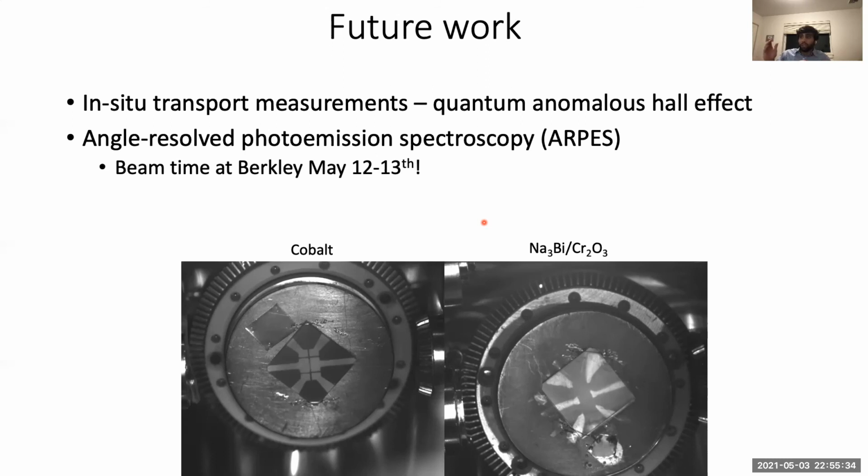And so as you can see below, these are images of material that has been sputtered. And this pattern that we sputtered onto the material is called a Hall bar. This is done by placing what's called a shadow mask, which is essentially like a cookie cutter outline of this pattern you see here, over the material, and then shooting charged argon particles at it, forming the pattern you see here on the material.